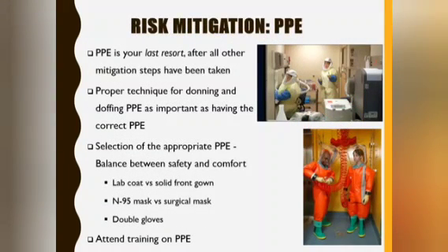Risk mitigation by personal protective equipment or PPE. PPE is the last resort after all other mitigation steps have been taken. Proper technique for donning and doffing PPE is as important as having the correct PPE. Following the selection of the appropriate PPE, balance must be struck between safety and comfort. And attend trainings on PPE.